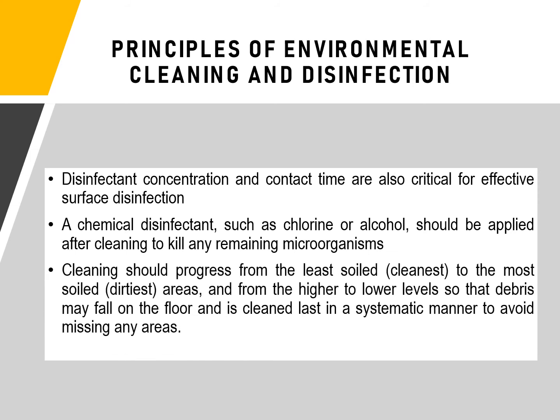The proper way of cleaning should progress from the least soiled or the cleanest to the most soiled or dirtiest areas, and from the higher to lower levels so that debris may fall on the floor and is cleaned last, in a systematic manner to avoid missing any areas.